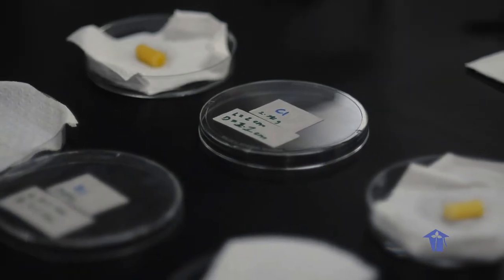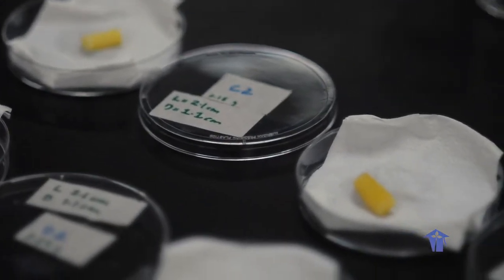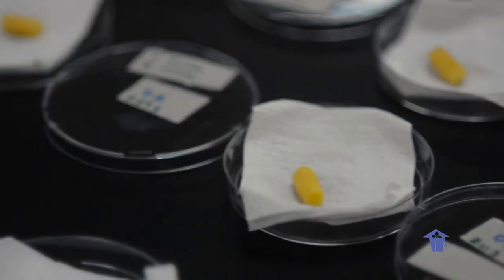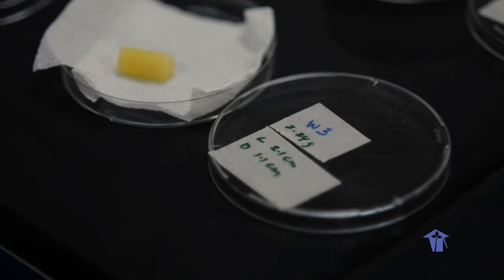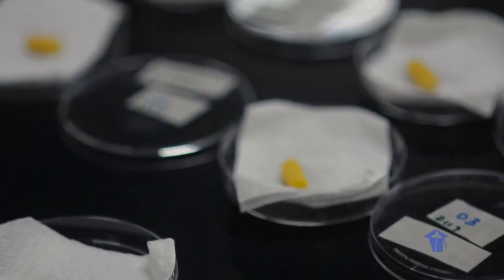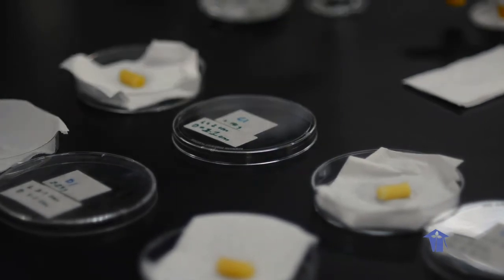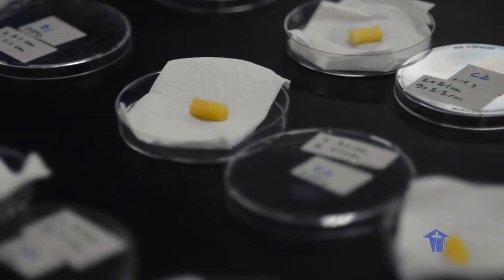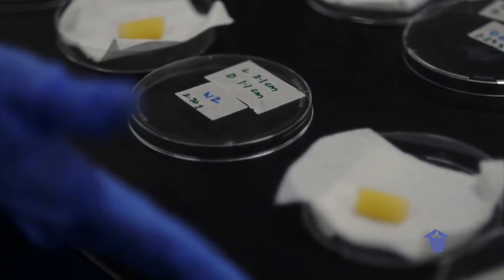So we've come back now to look at the results of our osmosis investigation using the pieces of potato. We had weighed and measured 2 dimensions of each of our potato strips, and those can be seen written on the covers of the Petri dishes next to each set. Remember that we had 3 sets. In this row, we have potato strips that had been placed into the concentrated salt solution. In the middle, all of these strips were placed into the dilute salt solution, and these strips at the bottom were all placed into distilled water.